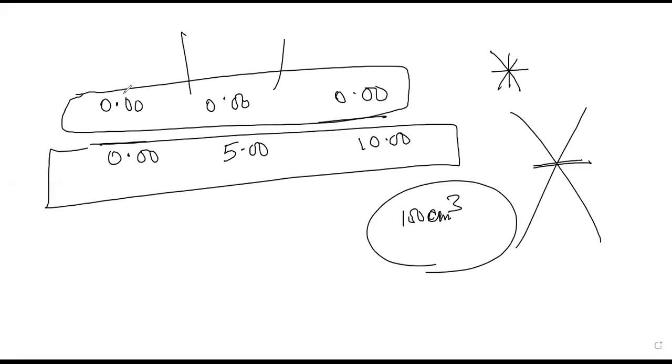When you start with 0, 0, 0, 0 as initials, we are asking ourselves, your solution is reducing and your solution is changing. So every time you are feeding it back to 0. So we don't like this. However, nobody will penalize you for it. But we don't like starting from 0, 0. Here you are trying to tell me that you've not done the practical.